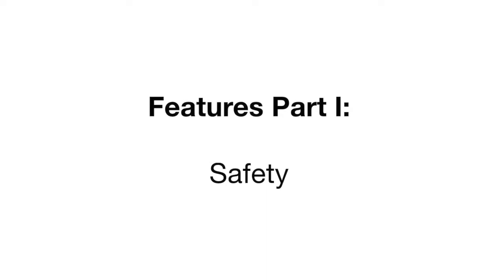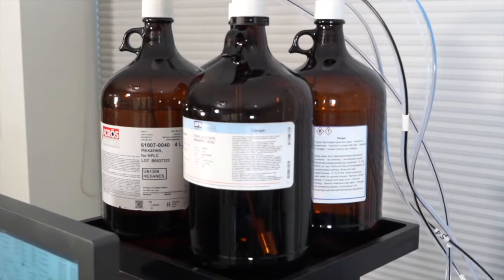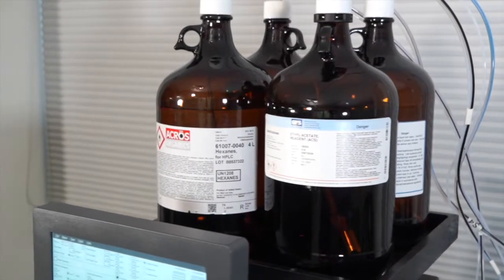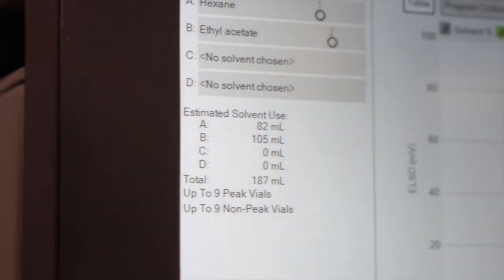Let's kick things off with safety features. We have four independent channels to connect up to four different solvents for a single run. For each solvent line, there's a level sensor line which determines the amount of solvent remaining in each bottle. Before a run, the system will determine how much solvent is required for the separation and if another bottle of the same solvent is connected, the system will auto-switch which line is drawing the solvent to seamlessly continue purification.